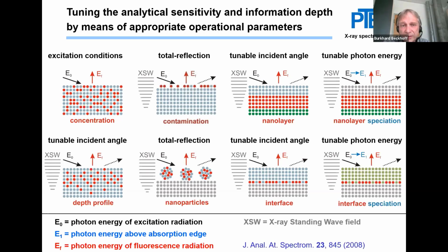So what's of interest is to use on a flat substrate the so-called X-ray standing wave field that is formed for the determination of contamination, a nanolayer, or a near surface diffusion profile or implantation depth profile. We can probe nanoparticles or even near surface interfaces.